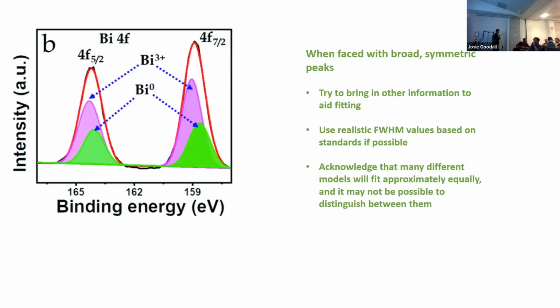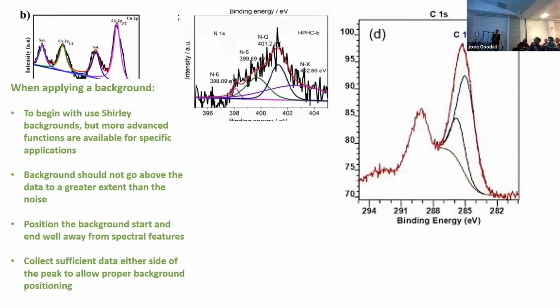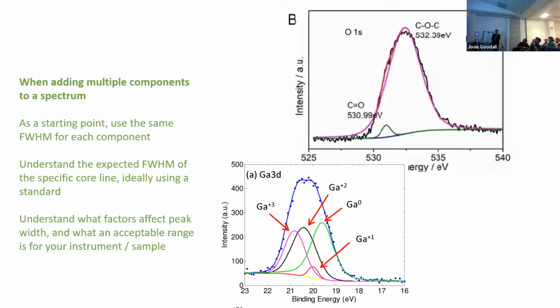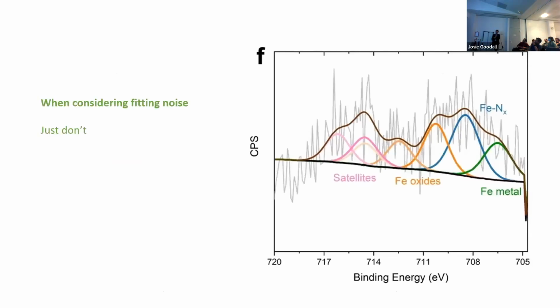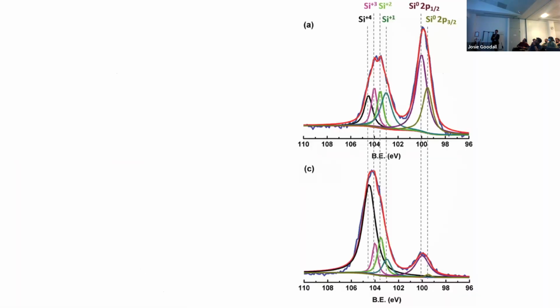When you talk about errors in spin orbit splitting, you start with silicon, which is an interesting case, right? Because when you oxidize silicon, the spin orbit splitting appears to disappear. With elemental silicon, you see it with high enough resolution, but for oxidized silicon, you get a very symmetric peak that's very often, almost 100% of the time, fitted by ignoring spin orbit splitting.